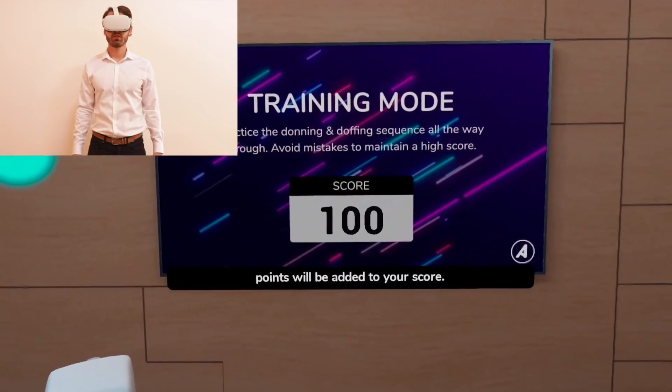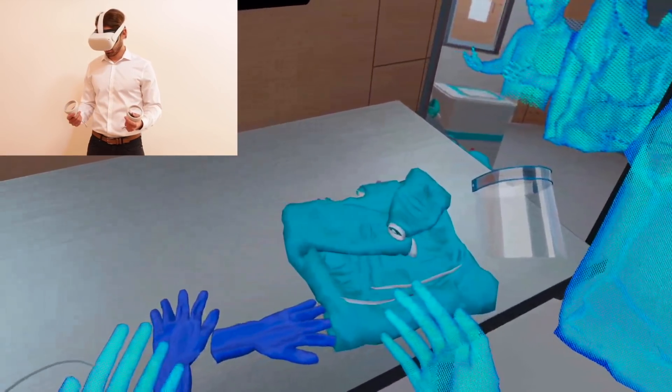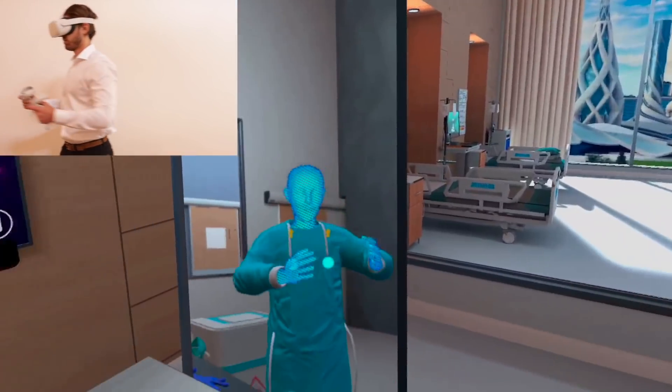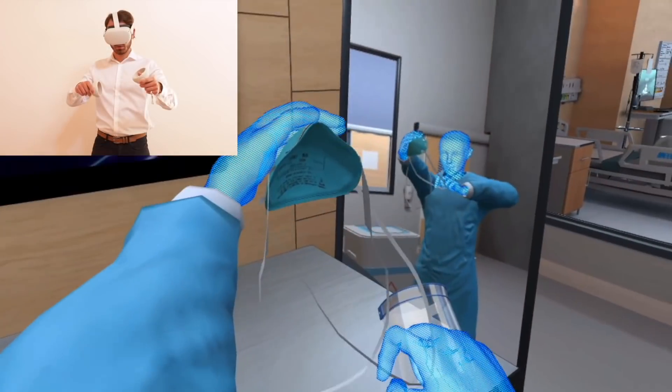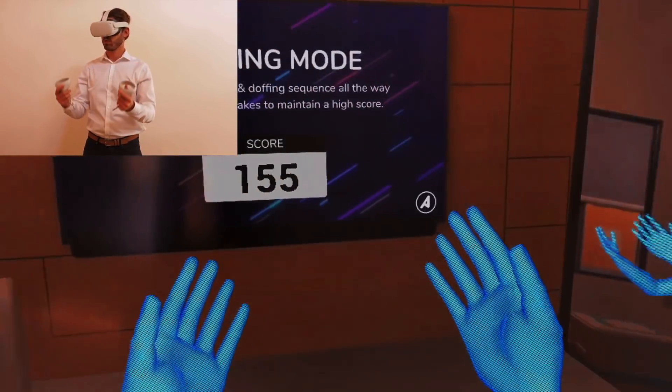If you do things right, points will be added to your score. Now continue through each step at your own pace until the donning process is complete. Try another option.